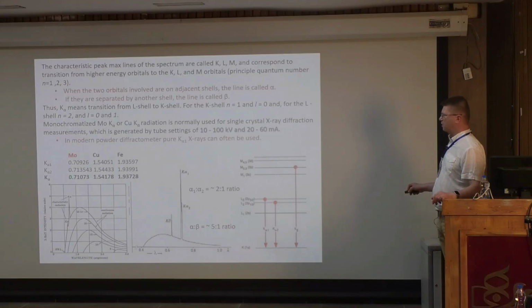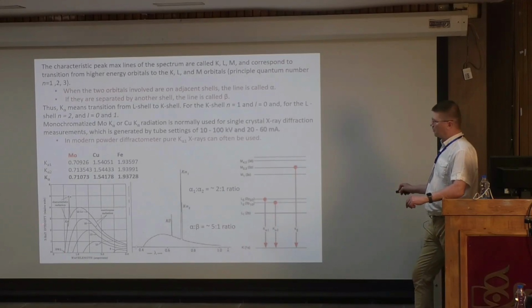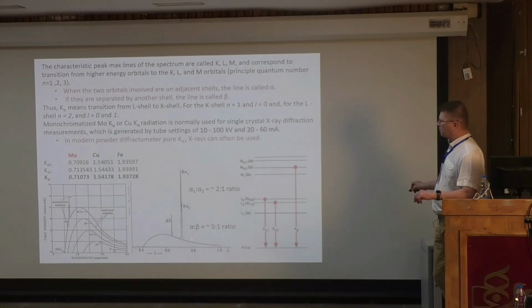And the point there is that I like this image, hopefully you can see this nicely. So here you can see one spectrum, second, third, fourth, and so on, with different voltages. So now you can see that this is a kind of flat spectrum which comes in here, unless you hit 25. When the voltage reaches 25, these peaks will appear. So these two. So these are the characteristic X-ray radiations which are coming in there. And this is the whole spectrum.